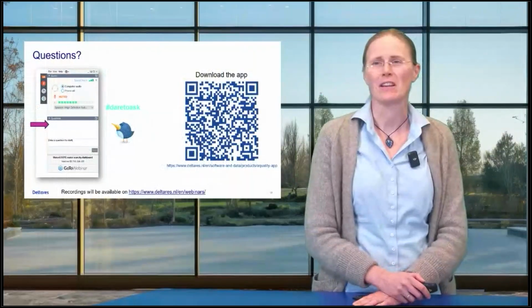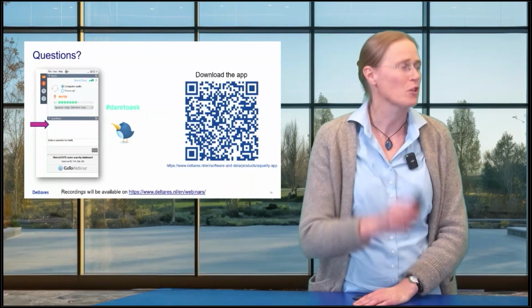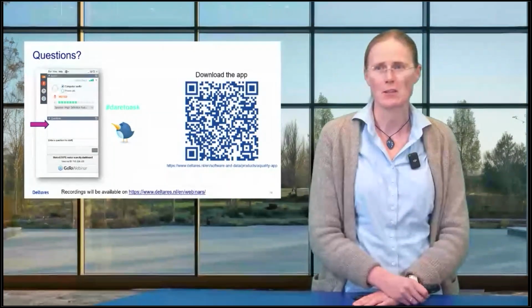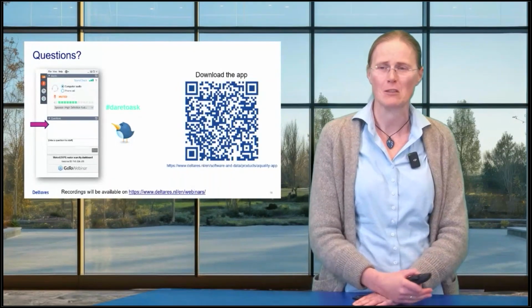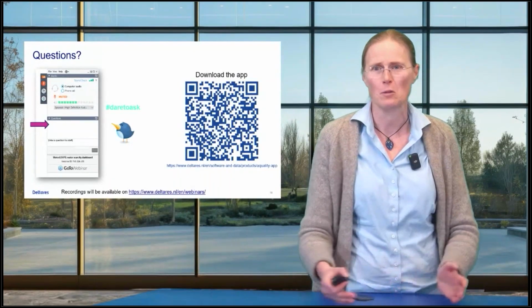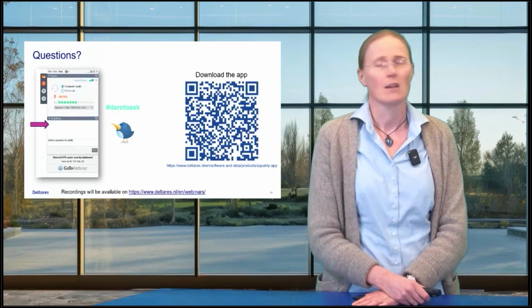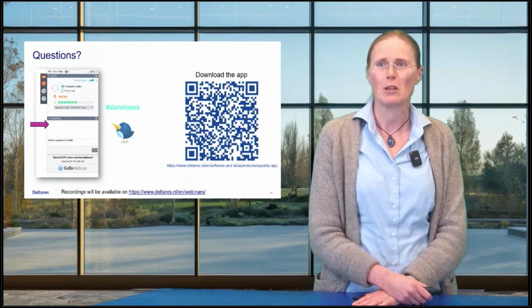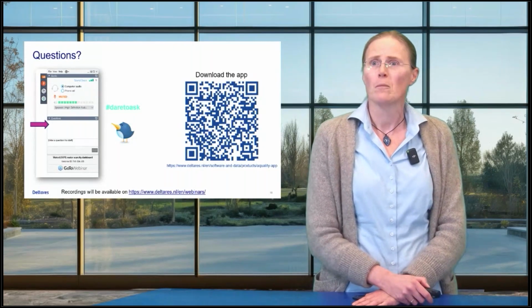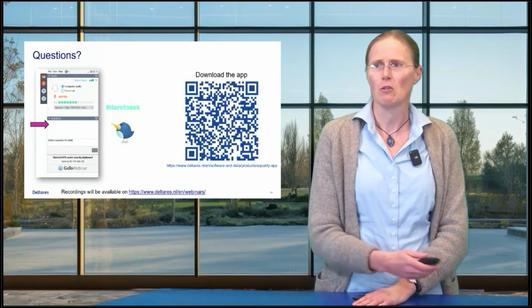It's good to know that there's also a manual change that you can do. So if you're trying something and you make your own method, and you keep doing it consistently in always the same way, always having the same method for that, it's up to you to keep track of that. But it is possible to at least put the number in. I think that is all for the questions right now.